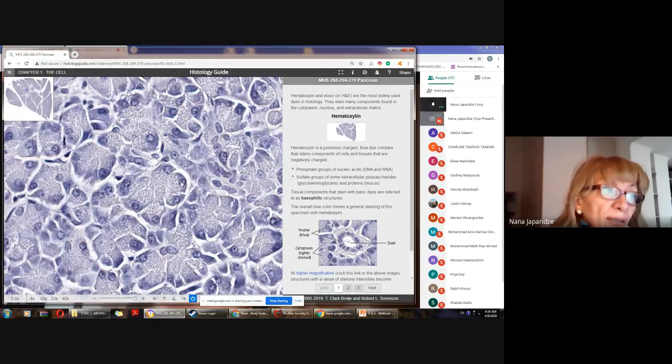You see clearly in the nucleus itself the nucleolus, this dark, centrally or peripherally allocated quite big dot, and plus using this type of staining we can identify euchromatin and heterochromatin, and make a conclusion about the level of activity this cell has.